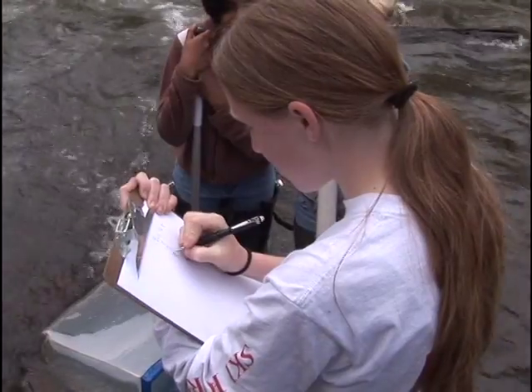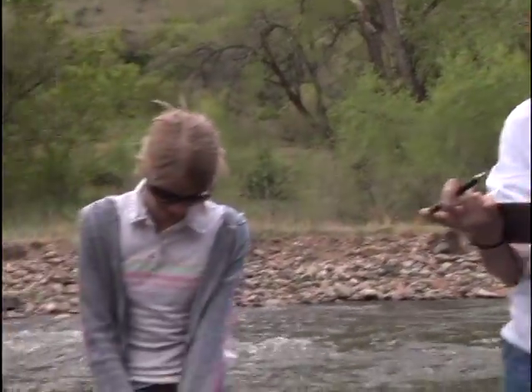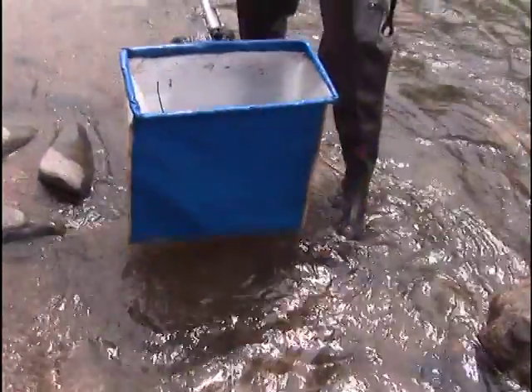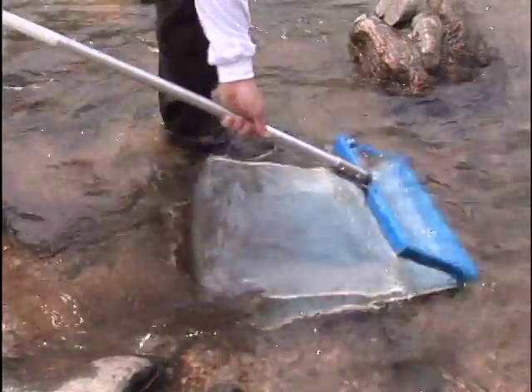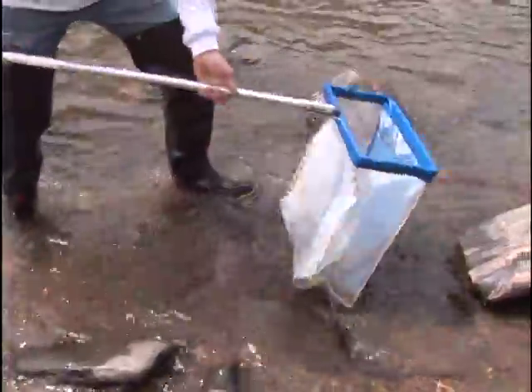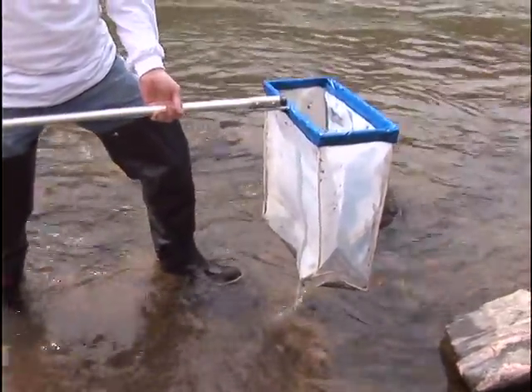Now that we have recorded all the kick area information, pick up your net and move to the second of the 4 kick locations. When picking your net out of the water, it's important for you to be careful not to lose any of the sample or debris. Pick the net up gently and use the water to shake that sample down into your net. Do it 2 or 3 times in order to get all your sample down into your net, and then move to the next sampling location.